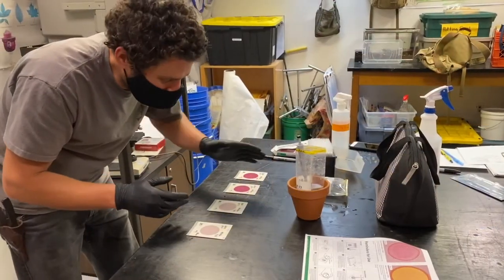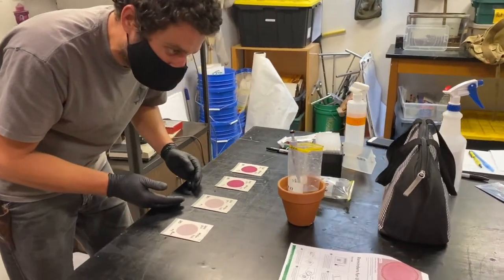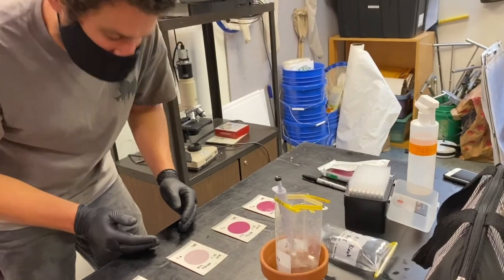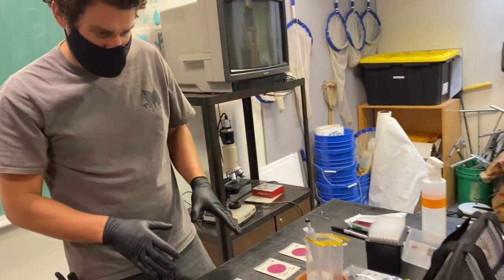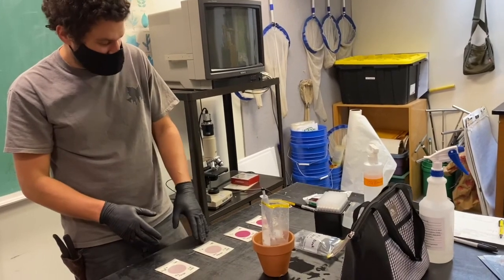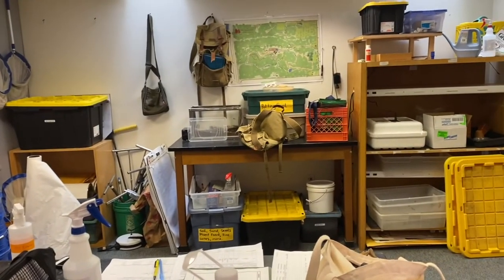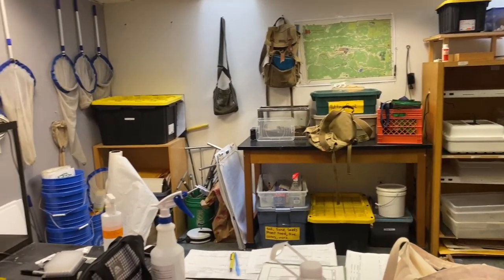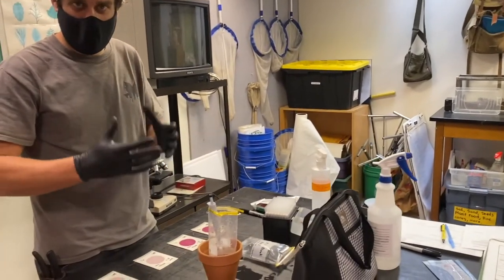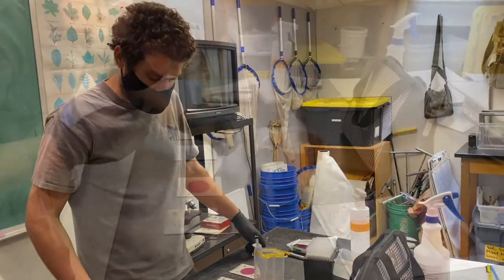Now we are taking the samples from the river and putting them on the film. The film will measure E. coli coliform bacteria colonies. We're putting 1 milliliter onto the film and then putting it in the incubator to incubate at 95 degrees Fahrenheit for 24 hours. Tomorrow we'll come back and be able to see which E. coli coliform colonies have grown and get a sense of the amount present in the water.